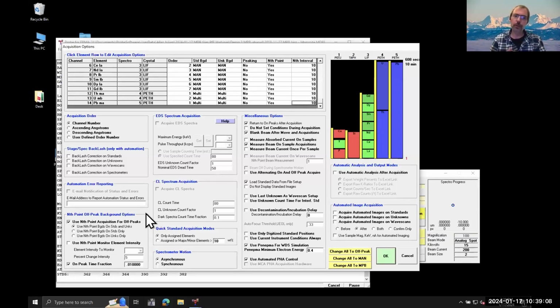So you may not want to acquire the backgrounds on every point. What we do typically for monazite is that we choose a homogeneous material or a homogeneous domain. We acquire the background on the first point only, and then on the next points, we acquire only the peak intensity. So imagine you have 5 points. You will ultimately have 4 data points, the first point being just the backgrounds. That's a very nice and cool feature that saves you time.